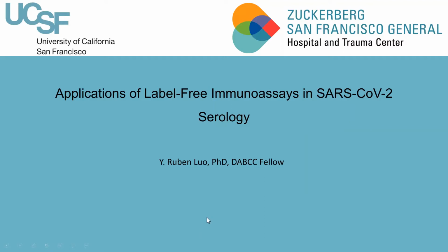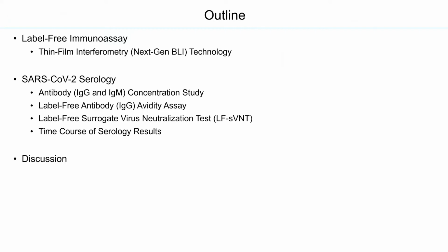I am very glad to have this opportunity to present the label-free immunoassays that we established in our clinical lab for SARS-CoV-2 serology tests. The content of this webinar will cover an introduction to the label-free immunoassays, and then we'll talk about the SARS-CoV-2 serology tests, including the methodologies and the test results. And then we will have some discussion points to share.